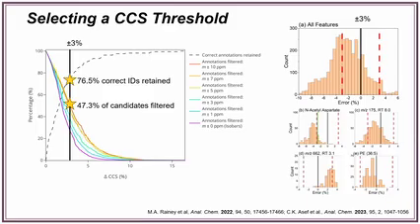And it can change quite a bit for different types of molecules. So lipids might be slightly different than metabolites, and so it's important to test this for yourself to see how it works. In this particular example, they're using a 3% cutoff. And so you can see that the percent error between the true CCS value and what the model has predicted for a large set of metabolites all tends to be skewed to a lower mass range. And so there's just some trends that you might pick up on when you're looking at these.